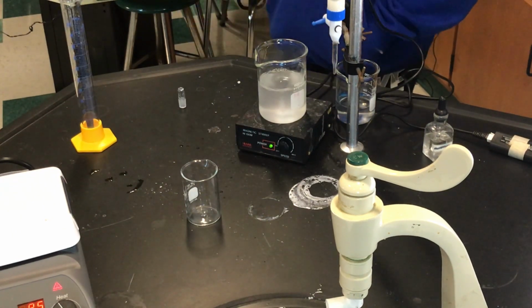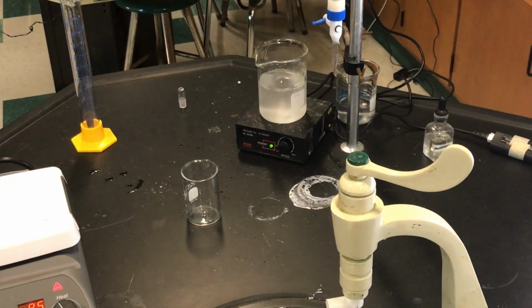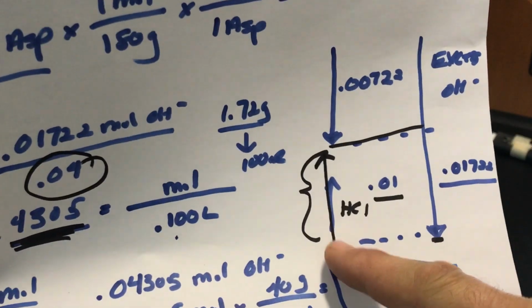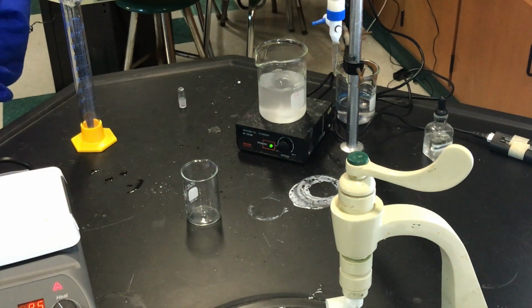Okay, so now what did we just do? We just got to this point, we overshot our projections with the excess amount. So now we're here, and now we're going to titrate back. So we have base sitting in this beaker. Stay with me, we're almost done.